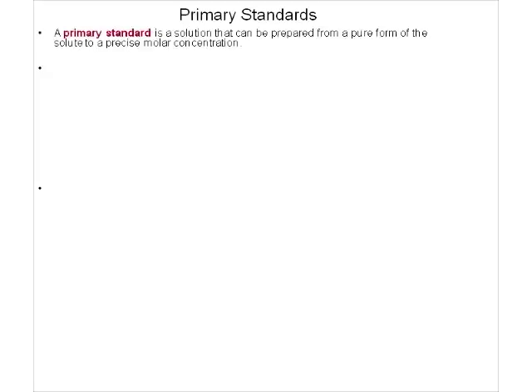So what we have to do then is standardize them. We have to see if we can measure what their current status is. If we take the hydrochloric acid off the shelf and we're not sure of what the concentration is, we have to standardize it so we can actually measure the accurate concentration of the acid. And what we have to do with that is a titration experiment, like we're going to do, with what's called a primary standard. Primary standards are substances that are 100% pure, regardless of if we leave the cover off them and store them overnight, or if we have them stored in the chemical cabinet for 2 years or 5 years or whatever. Every time we go to them, we're confident that they're going to be 100% pure.